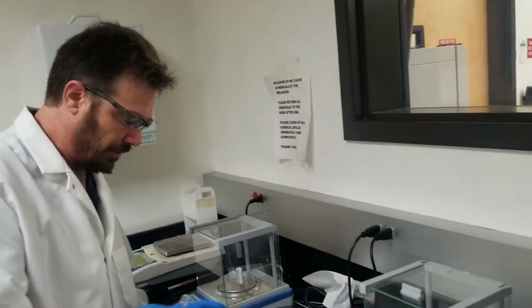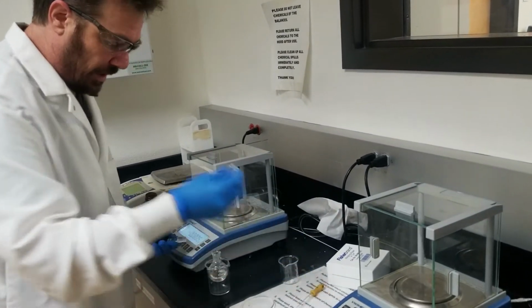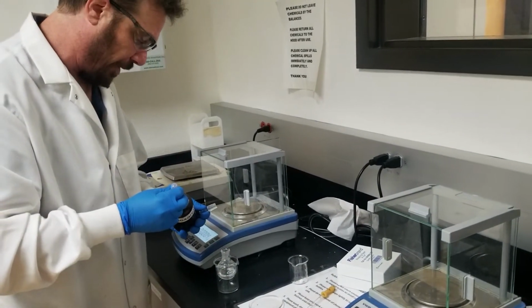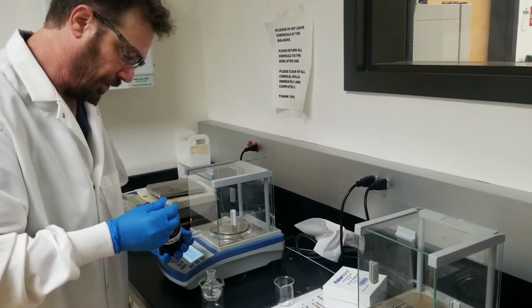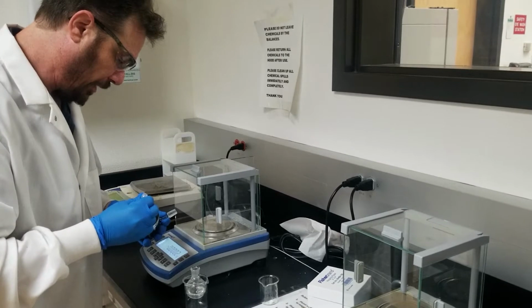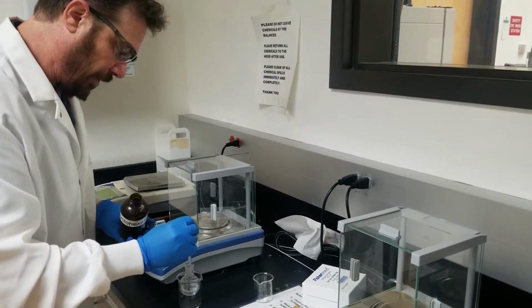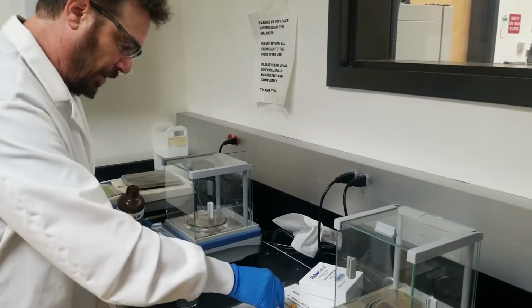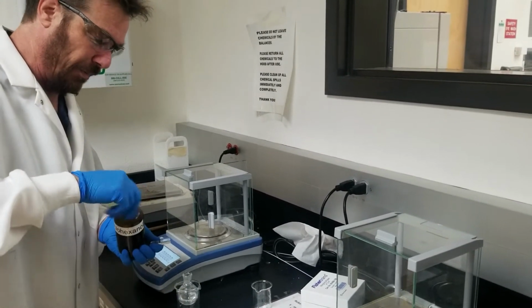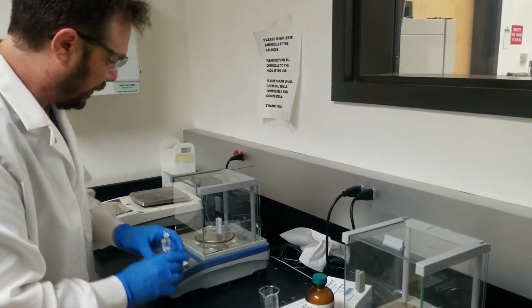And I know I've got a whole bunch of people behind me waiting to use this balance, and here I am futzing around. Now you could just get a graduated cylinder out and measure it out that way too. We're just choosing to do it this way. So we'll put another squirt in here, a little bit more. And if we go over to 13, it won't kill the experiment. If we end up with 9, it wouldn't kill the experiment. We just use whatever we're going to get here as our basis to get our final percent yield.